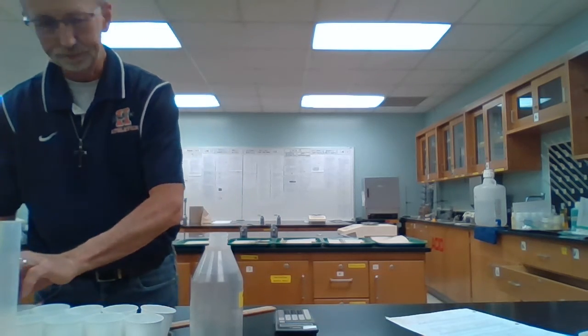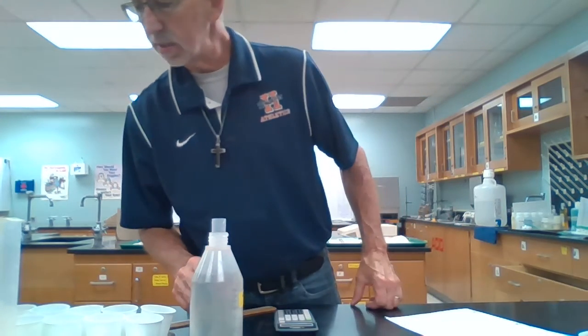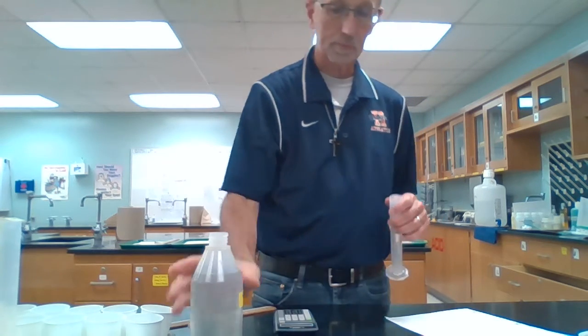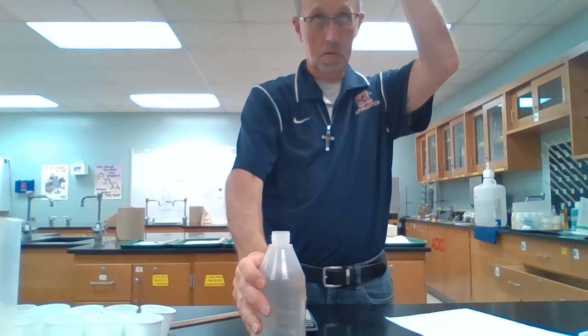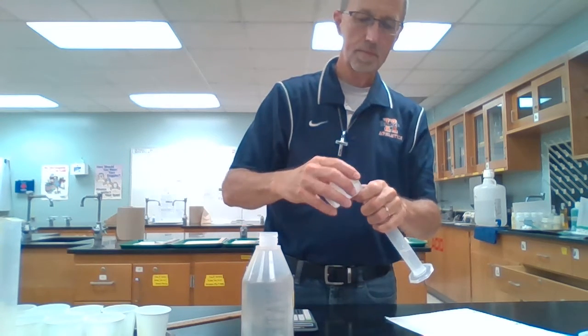All right. Now we are to zinc. Looks like for all the zincs I'm going to have to do water displacement, so we're doing a lot of this. Okay, here's the first one.